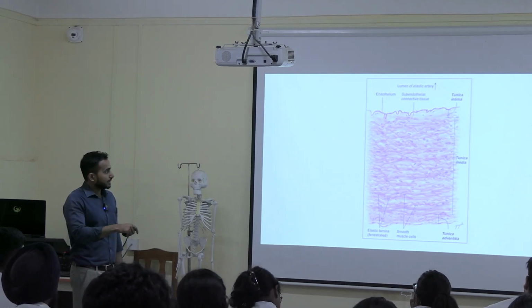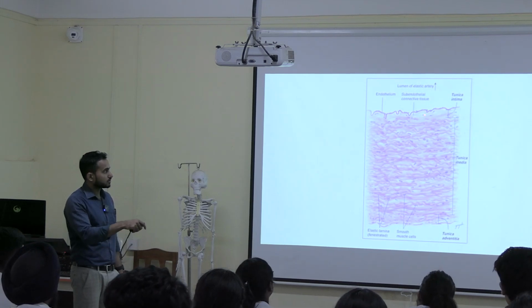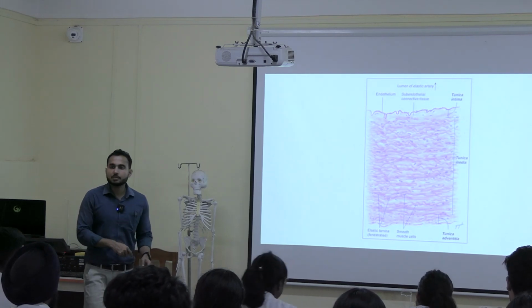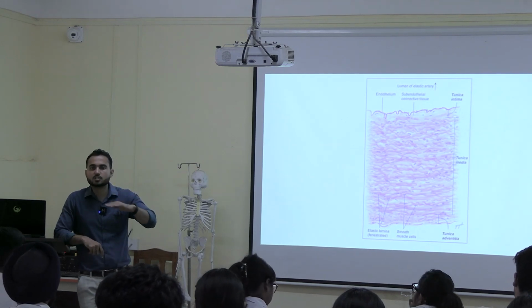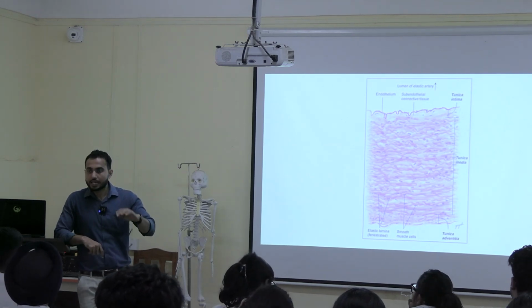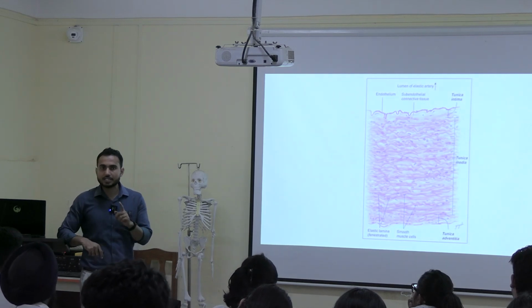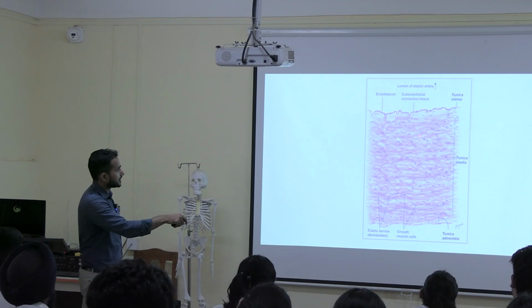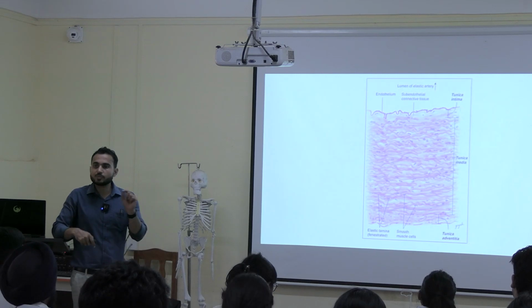Next, this entire thickness is made up of tunica media. Now in tunica media two things are there. First, there will be sheets of elastic fibers. In between the sheets of elastic fibers, you can see smooth muscle fibers that you have to identify in the elastic artery. These are the sheets of elastic fibers, and these are the smooth muscle fibers.